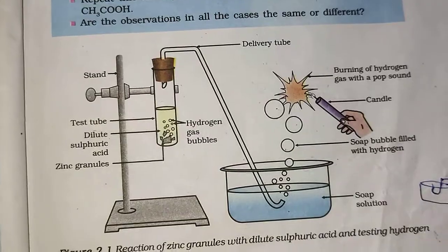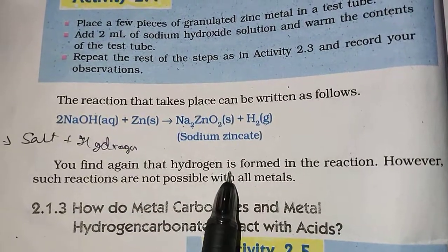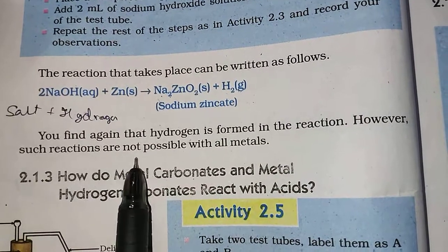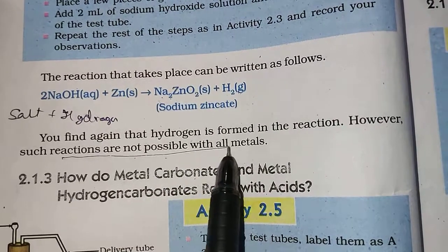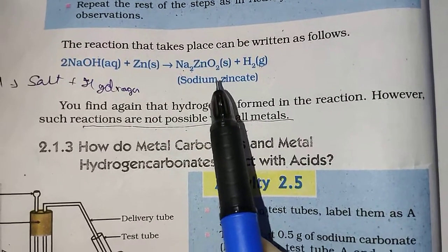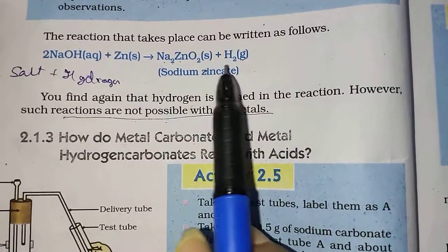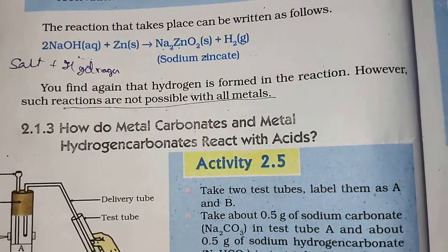So this pop sound will indicate that there is hydrogen gas. You find again that hydrogen is formed in the reactions, however such reactions are not possible with all metals. So all bases cannot react with all metals to form such salt and hydrogen. This reaction is possible only for some metals and bases, but not all metals are able to react with base to form salt and hydrogen.